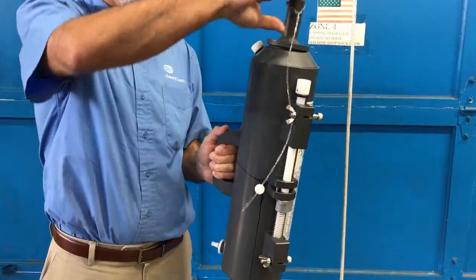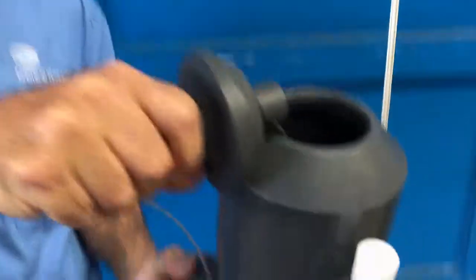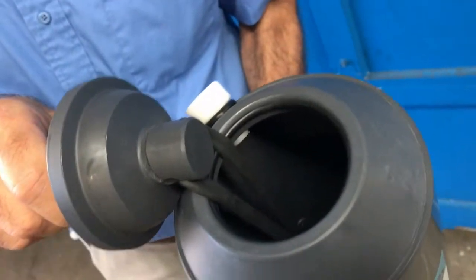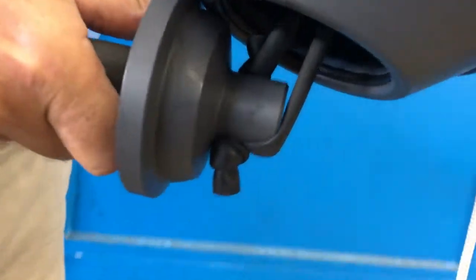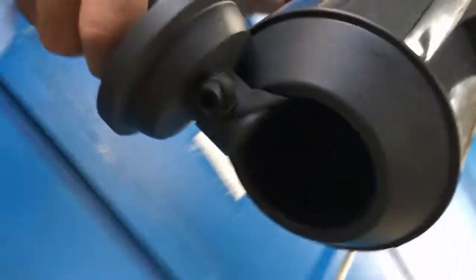Each end of the bottle has an end stopper. They are joined together with latex tubing which gets looped through the end stopper at one end and tied on at the other end.